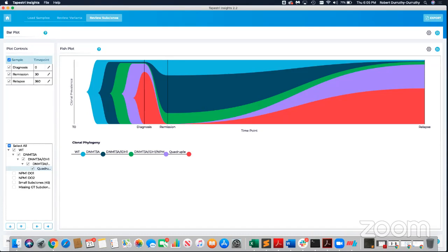We have a couple questions from attendees. So will you always see the homozygous and wild type clone if it's ADO?